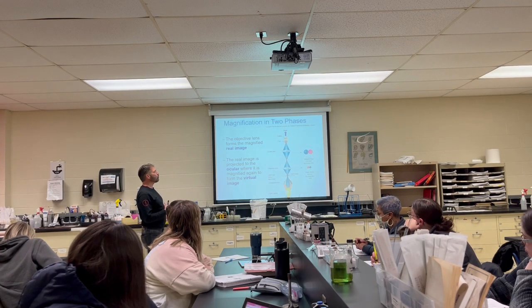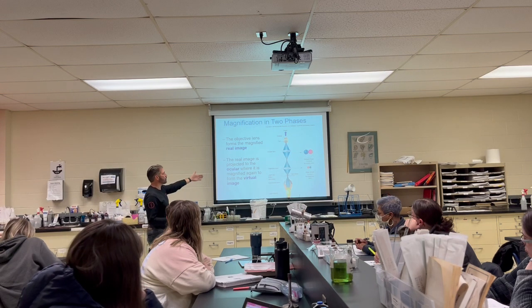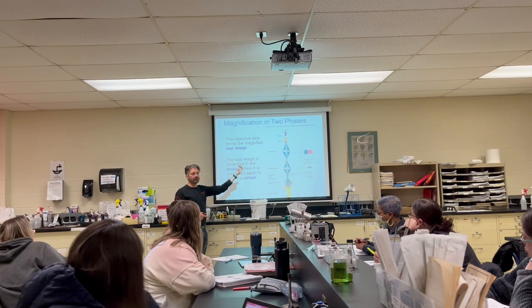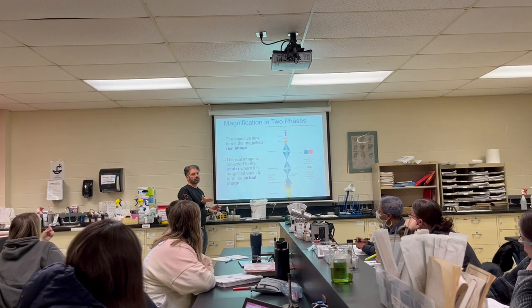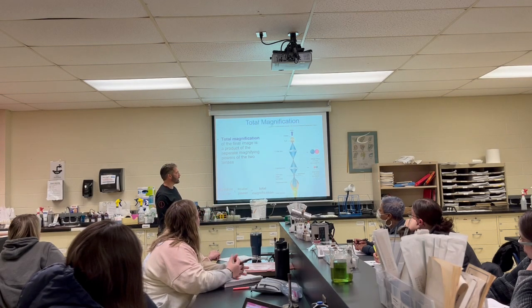Your real image is projected into the ocular, whereas magnified into a virtual image. So just realize your image gets flipped. When you go to do your lab, it's going to say, if I move the stage right, what do you think happens to your image? It moves left. You move the stage away, the image moves towards you. So if they ask you a question like that, you should know that. Or if you forgot, we're just going to go over it again.